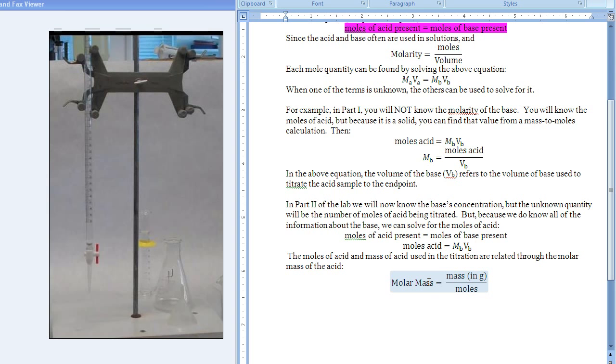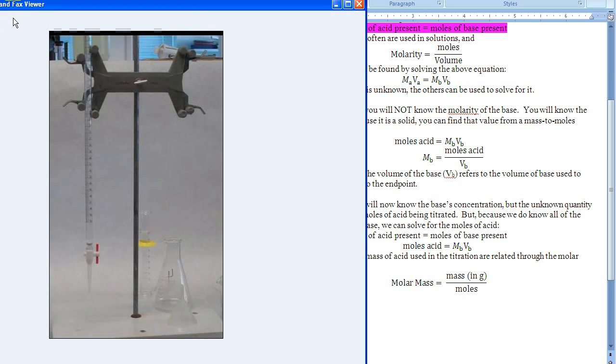Let's briefly look at some of the techniques in the procedure. You should have a fairly recent memory of conducting your titration. So I've pulled out a few pictures from our titration video that was made for the redox titration lab. Again, here's our setup. We're using a burette, the long thin column with a stopcock at the bottom, mounted properly into a burette clamp.